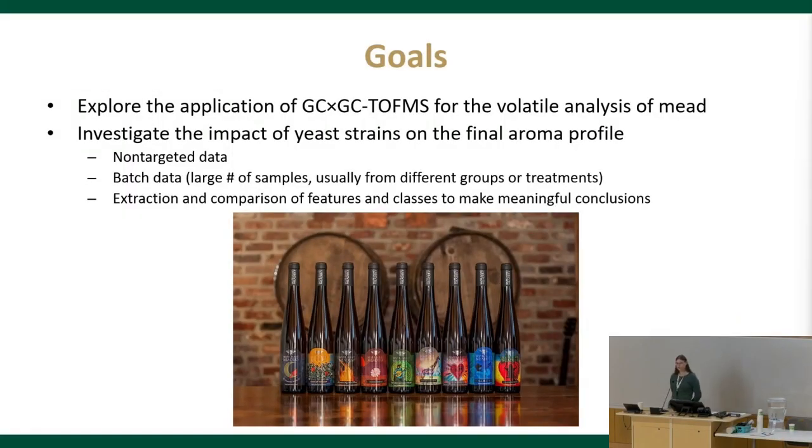The goals of this project were to explore the application of GC×GC-TOFMS for the volatile analysis and aroma profiling of mead products, and to investigate the impact of different yeast strains and honey concentrations on the final aroma profile. We were looking at this through a non-targeted lens, and we were hoping to extract and compare features to make meaningful conclusions about our sample set.